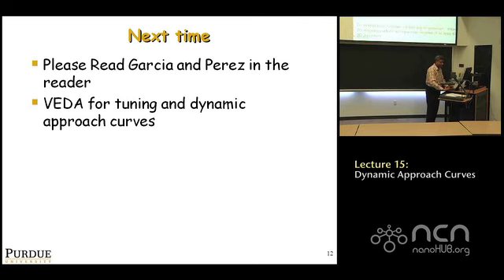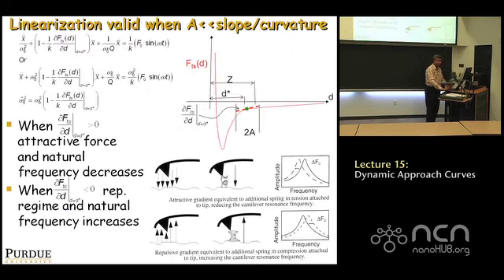And let me just reinforce that point a little bit. Go back to this slide, where the top right has shown a tip sample interaction potential. That green point corresponds to a point, number one, where the static force on the cantilever is attractive or repulsive. What's the value of force at that point? It's negative. Negative is attractive.